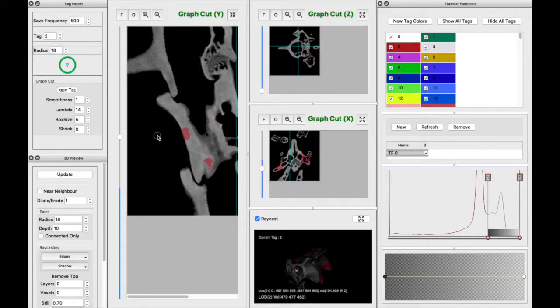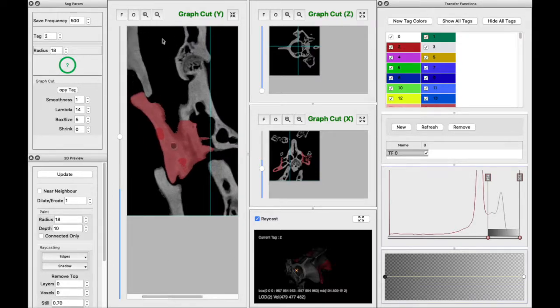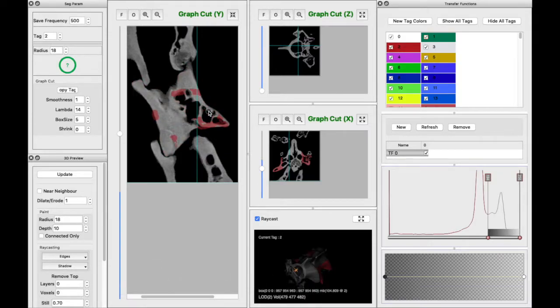So instead, we can just see how it goes with us watching over it at every slice. And we could actually extend the paint down over here because it's pretty much done attaching, as long as it doesn't extend too far up here. Nice, yeah, see it's, oh, it's isolated, but over here it's, let's just put a shift dot over there and it'll know to keep off that area now.